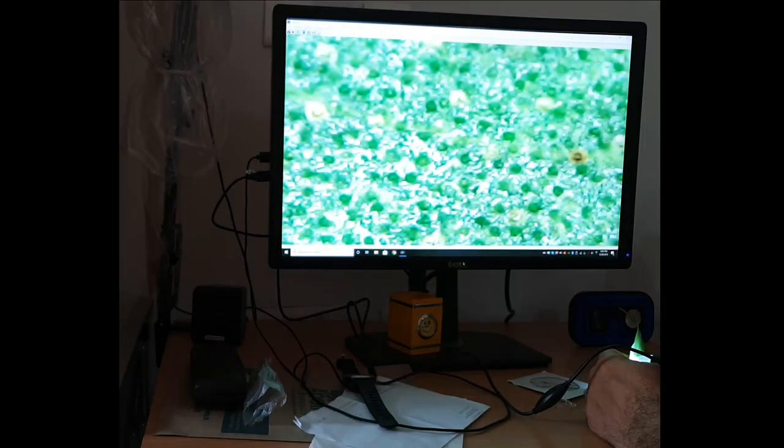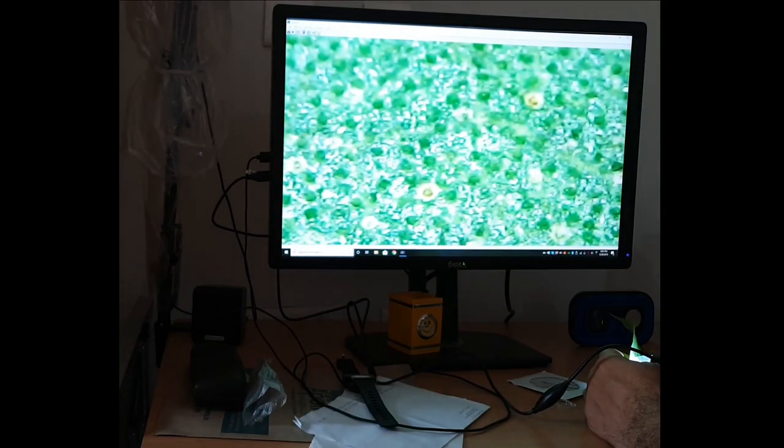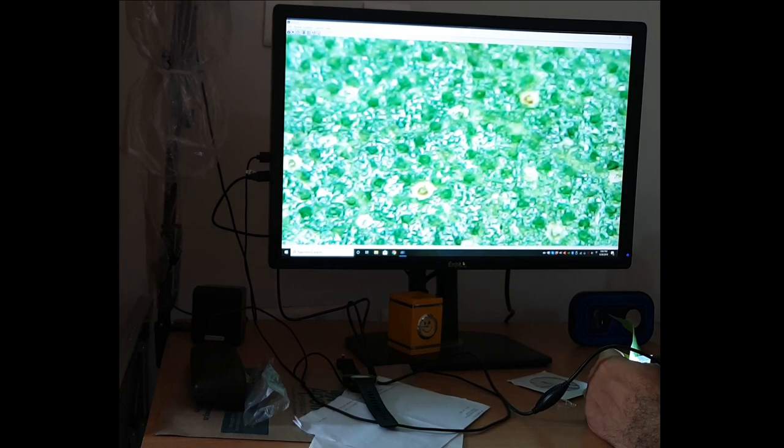Kids are really going to love this device. You have multiple things around your house which they can just place below this microscope and see how they look. Every surface is going to look different. This device also has an additional 6x digital zoom. Let's look at something more organic — the skin on your fingers. Oh my god. That's the skin. It's pretty scary.